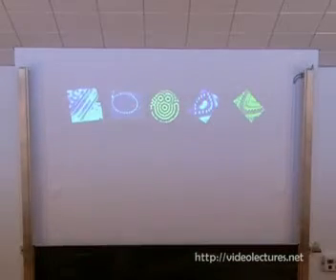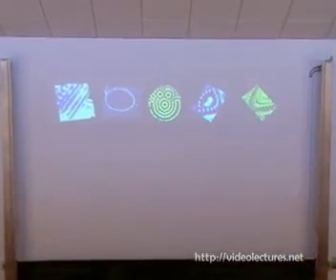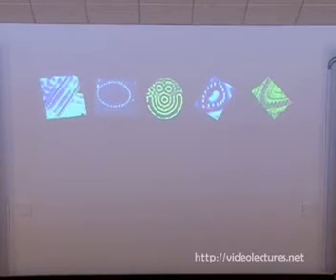Okay, and these are some of the images which we built, and this is one of the smallest smiley images. Right now it is in a high school textbook in New York. I have donated this one. And this, my student was just making fun out of it. It's a mouth. But actually it's a two parabola to test the local electronic structure.